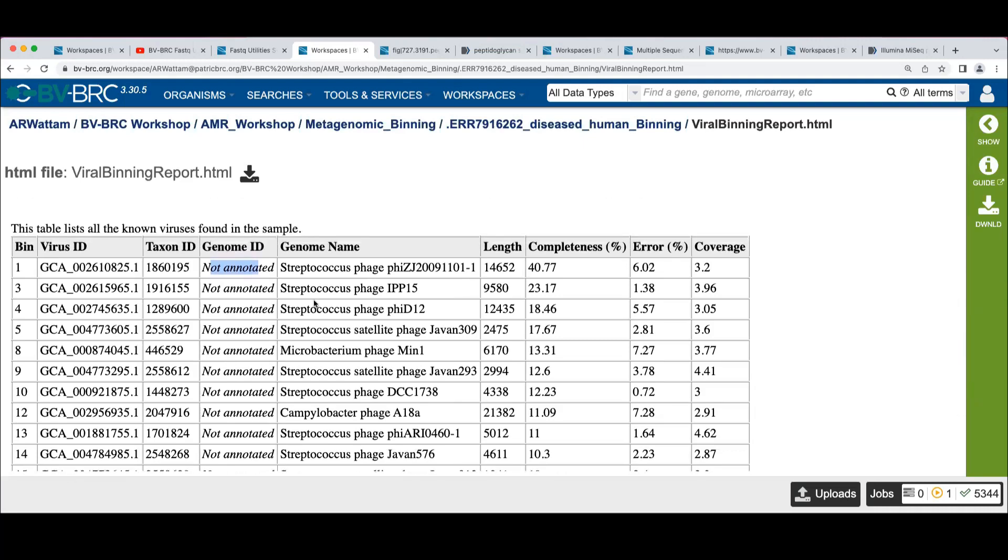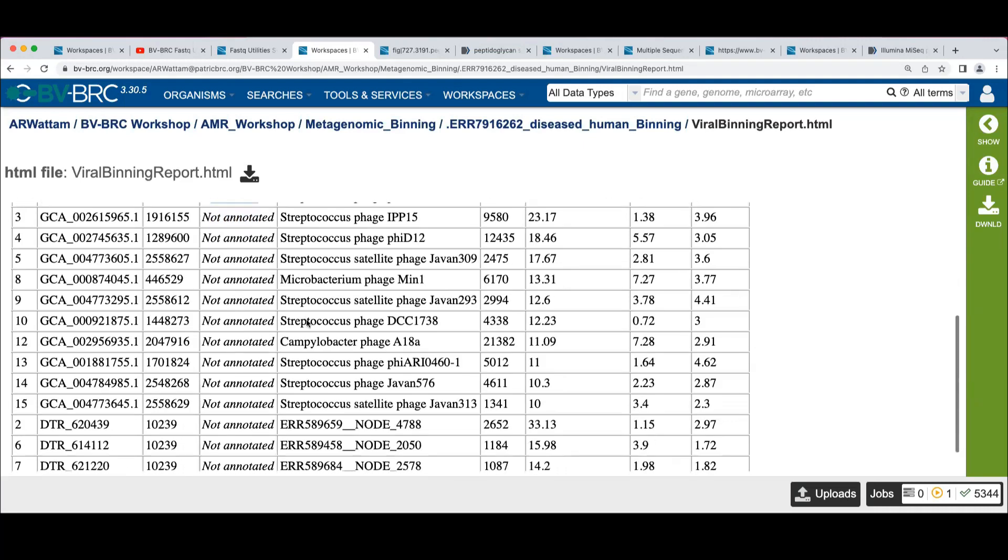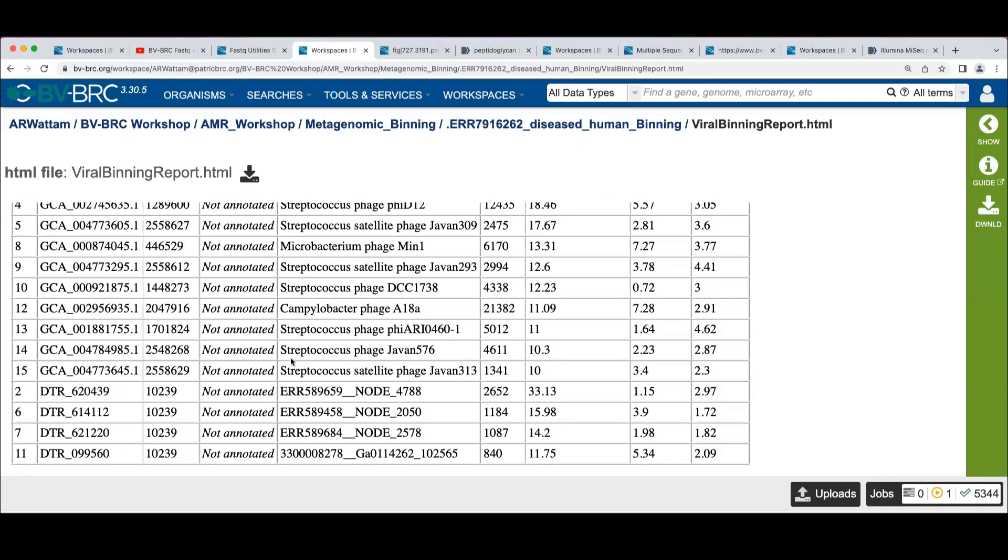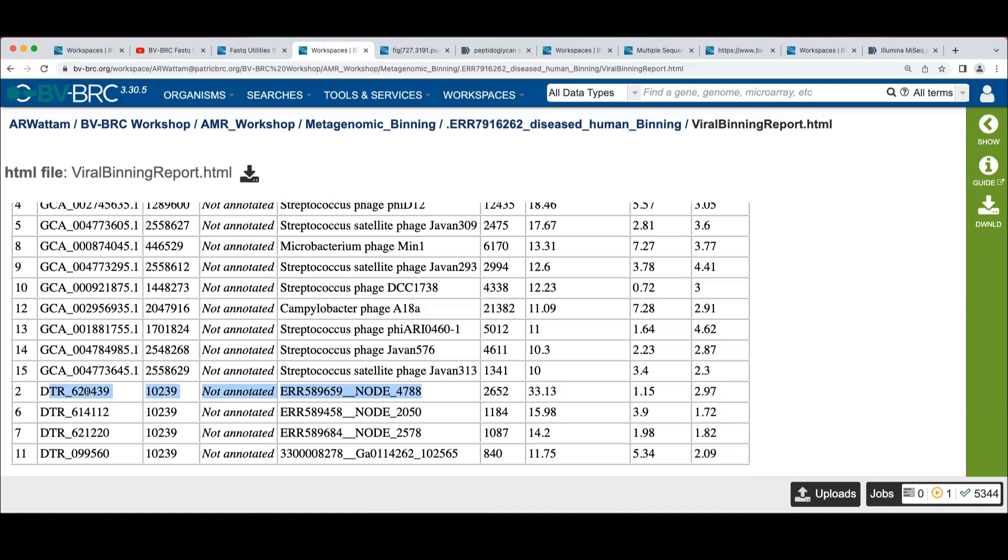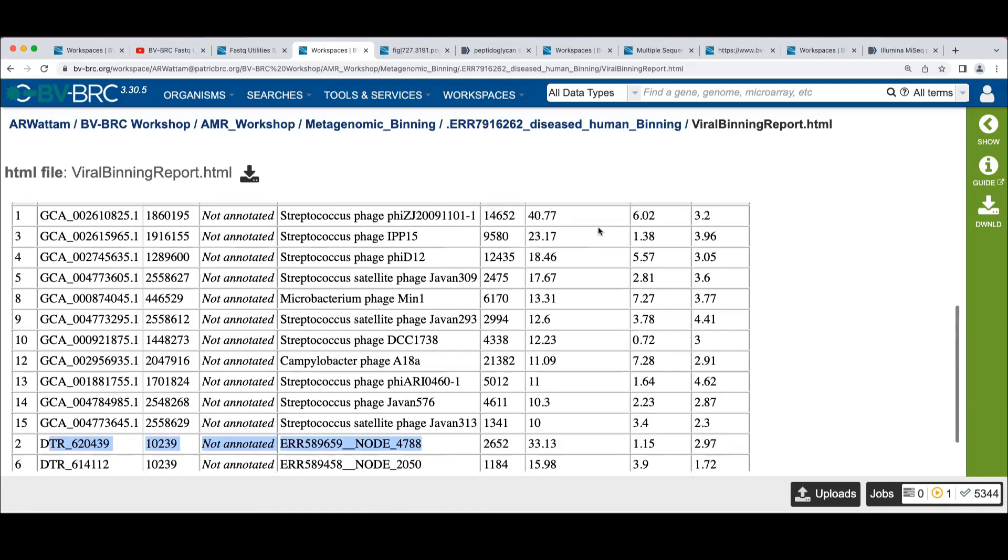So we see phages, actually a lot of phages here. We see some really ugly names here that these come out of a, I think it's a metavirome database that CheckV also uses to figure out what this means. We'd have to go reference back to the original database that I think we have references for somewhere here.